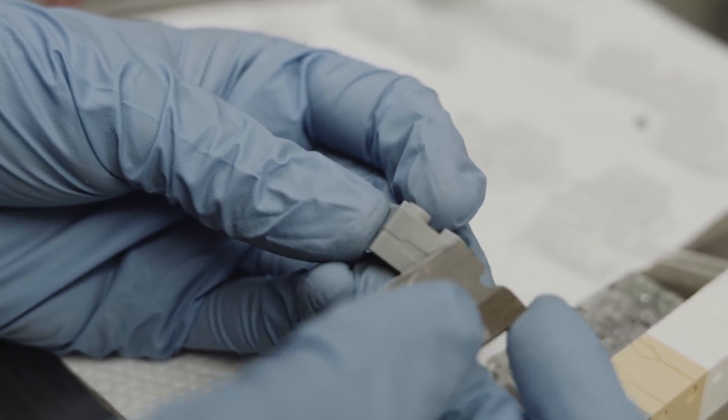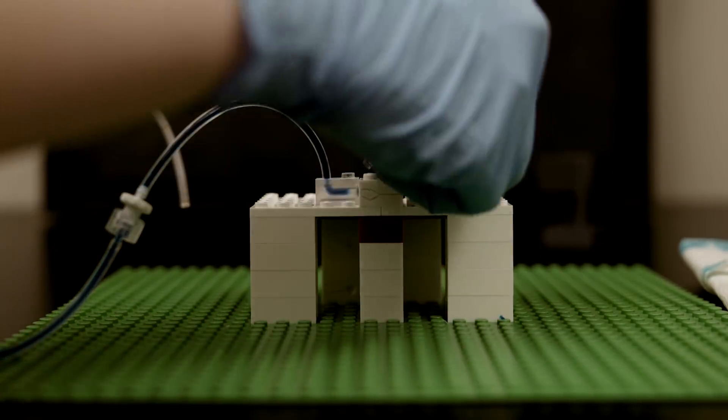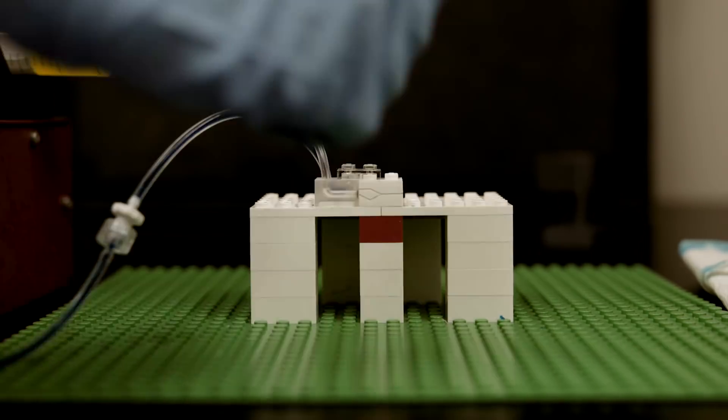Each brick can now be snapped together and taken apart to form modular microfluidic devices that perform various combinations and sequences of operations.